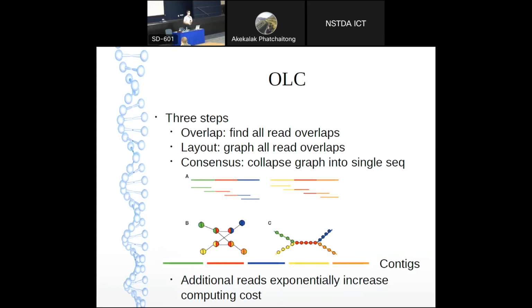OLC is very resource intensive. So because each read is aligned to each other read, any additional read that you add exponentially increases the computing cost.